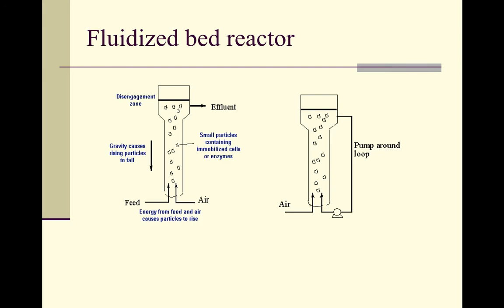So the disadvantage that we see in a fixed bed reactor, where certain parts of the reactor can have deprivation of oxygen, is negated in the fluidized bed reactor. Fluidized bed reactors are very, very commonly used to make animal cell products like growth hormones, insulin, and so on.